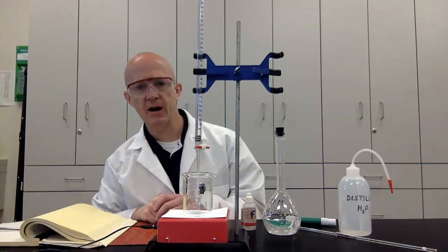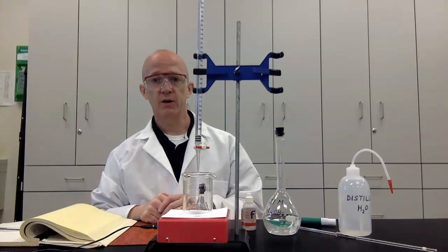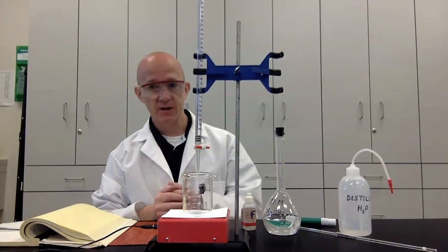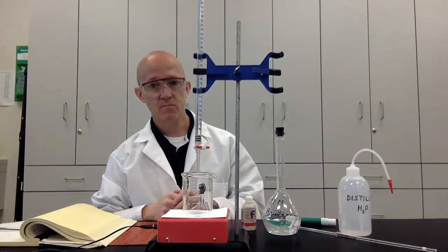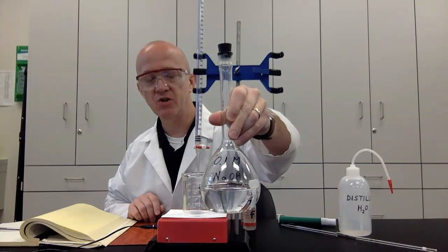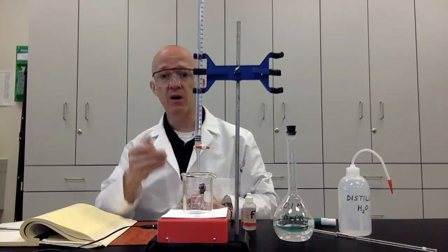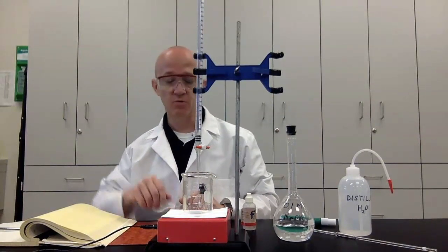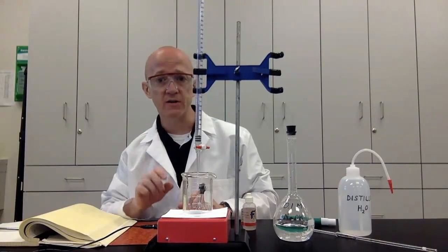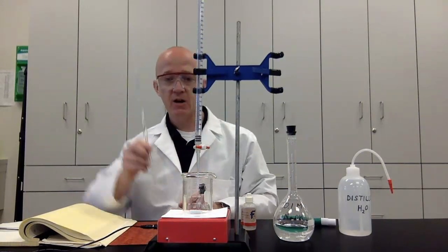The concept behind a titration is what we call a neutralization reaction, where you have an acid and a base, and when they combine they give us a salt and water. So because of this, I'm going to use a known solution. I've got 0.1 molar NaOH in this flask right here, and I'm going to see how much of this volume I need to neutralize the acid that I have. And I'm going to use a known quantity of the acid. In fact, I'm only going to use about 5 milliliters of the acid.